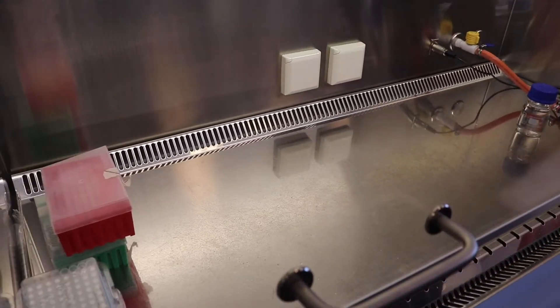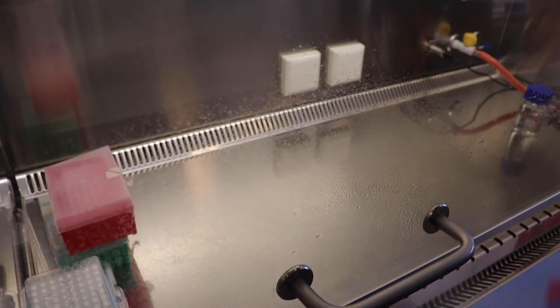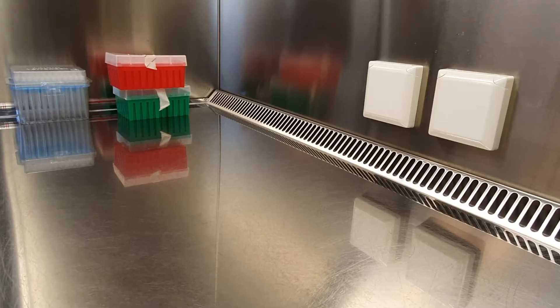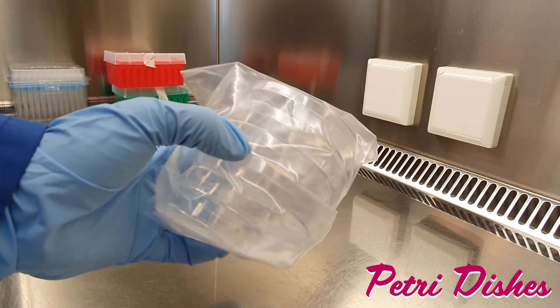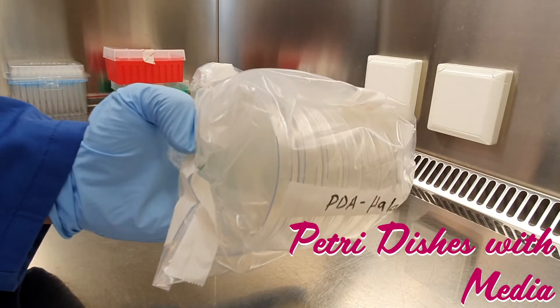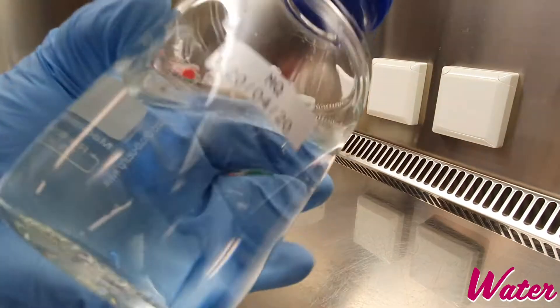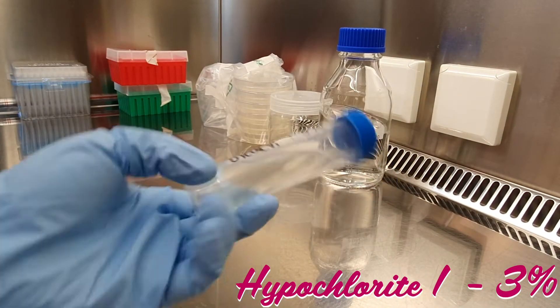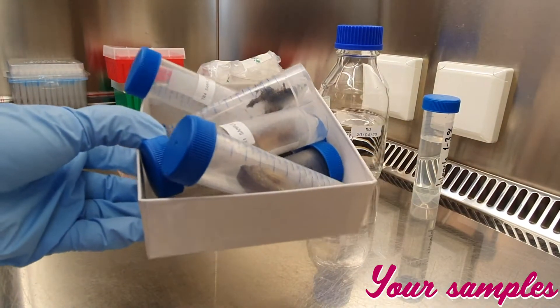The first thing we are going to do is clean very well, as usual. Now we are going to need empty petri dishes, petri dishes with media, filter paper, straw, water and bleach one to three percent, and of course our samples.